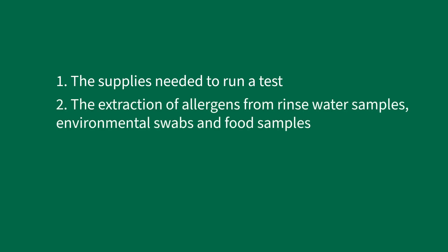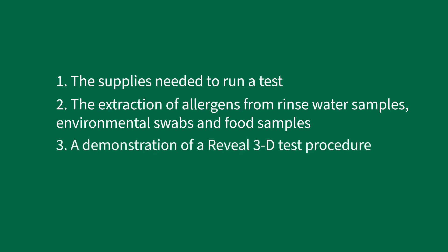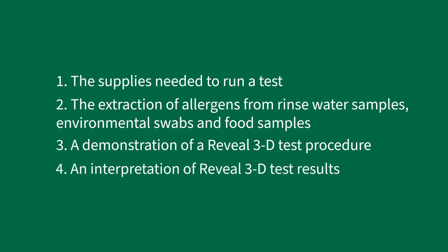This video covers the supplies needed to run a test, the extraction of allergens from rinse water samples, environmental swabs, and food samples, a demonstration of a Reveal 3D test procedure, and an interpretation of Reveal 3D test results.